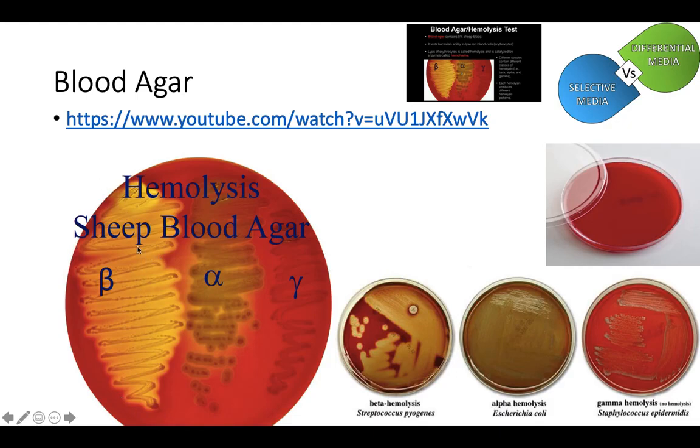And that's what you're looking at here. These particular bacteria, their hemolysins, have gone out into the agar, blown up all of the red blood cells that they've come in contact with, destroyed them entirely, removed all of the red color from this place in the agar. So like I mentioned earlier, this is nutrient agar plus blood. So if you have nutrient agar plus blood and you remove the blood part, you're left with a nutrient agar color, and that's what you're seeing here. So these guys have destroyed all of the red blood cells found in that agar. Very strong hemolysis.